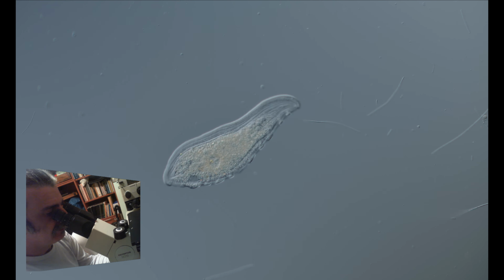Okay, now I'm back on the Petri dish bottom. You can see some scratches. Okay, here is that Loxophyllum. We'll go methodically. Here is again the Trachelius.